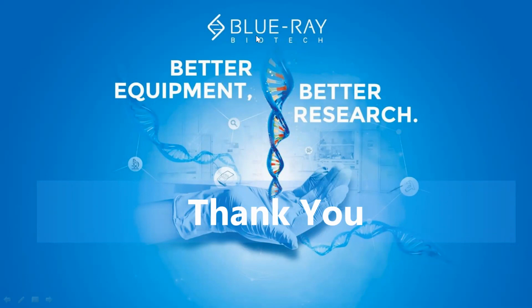The EzScope 101 is connected to the PC, the computer, so all the data will be saved in the computer.